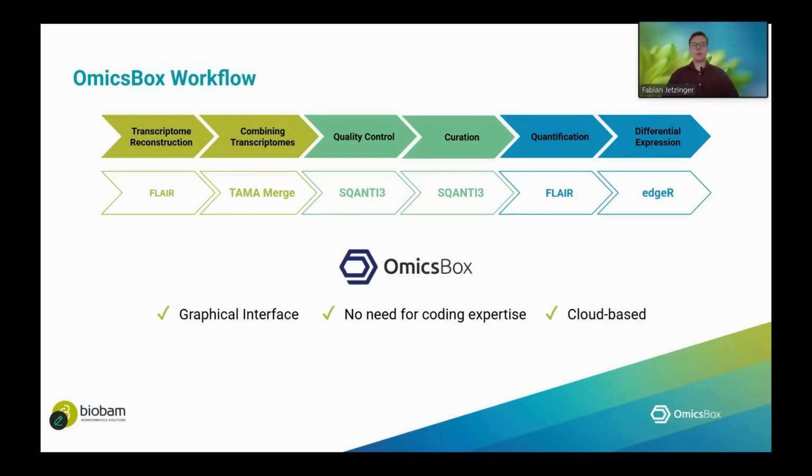Now, all of this we will do through OmicsBox, which offers a very convenient and easy-to-use graphical interface, meaning that users have no need for any coding expertise. And thanks to cloud-based execution of all of these different steps, it is also not necessary to have any dedicated hardware.